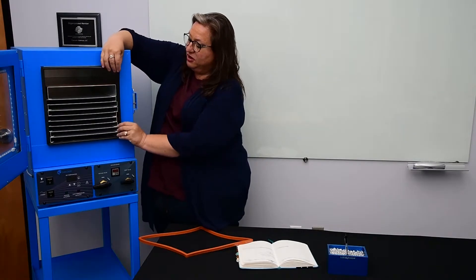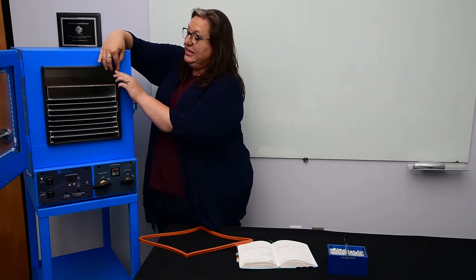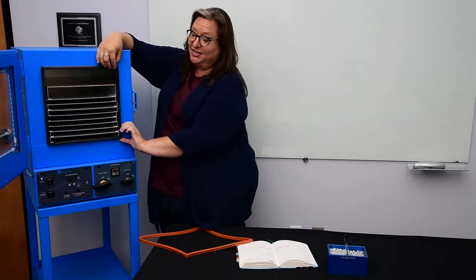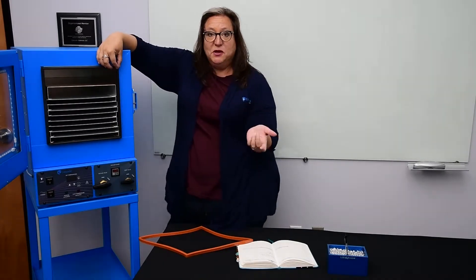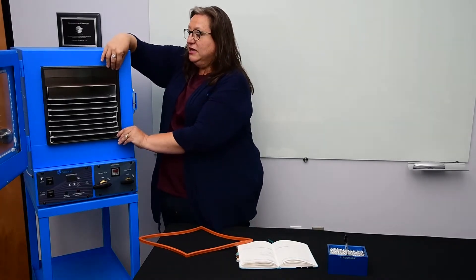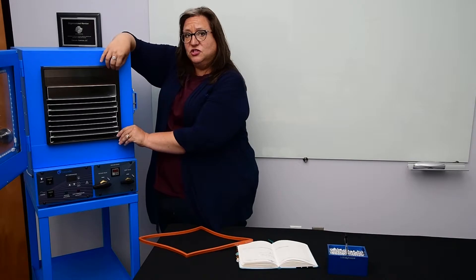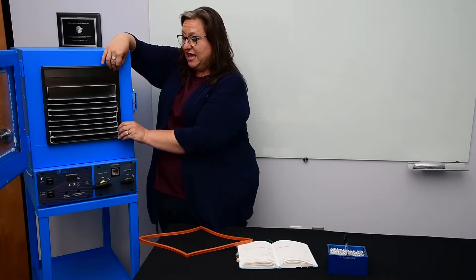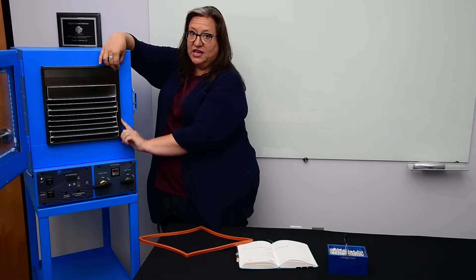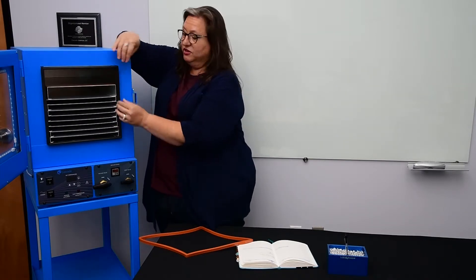When you get your oven, that writing is usually going to be on the leading edge. It's important to remember that because one way you can maintain your gasket's life over time is that every couple of months or so, during your standard inspection, you could rotate it. Remember which side had the writing on it and then rotate it 90 degrees.